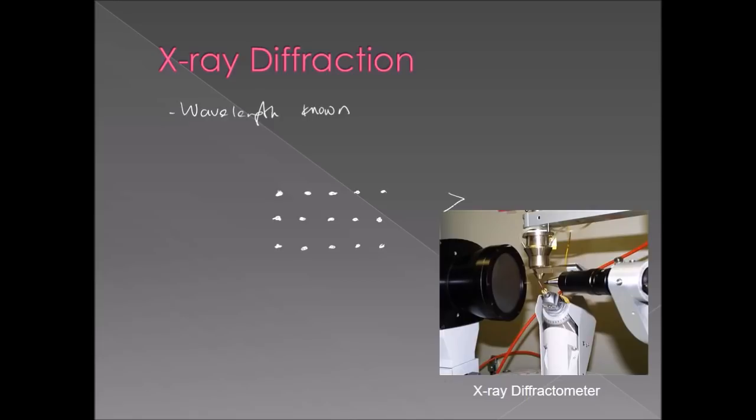If you look from here, you will notice it looks like there's a plane that joins those well-ordered molecules. If you look from the bottom, you might see something like this; there's also a long range order with planes. We call them planes.